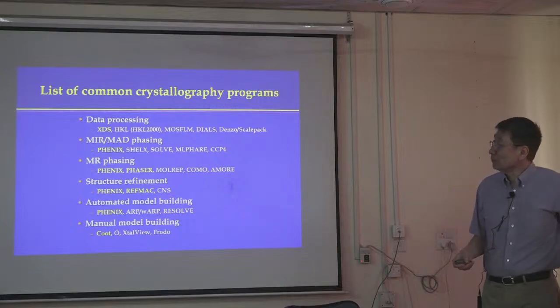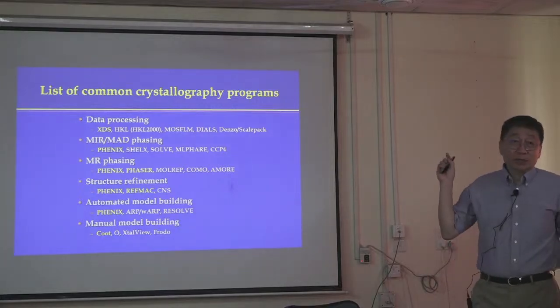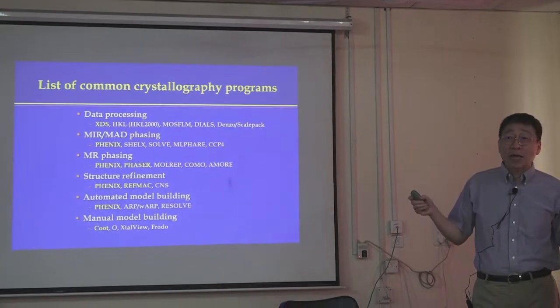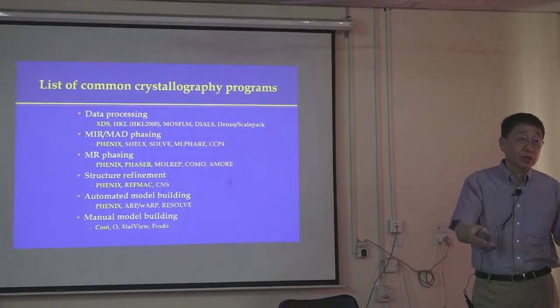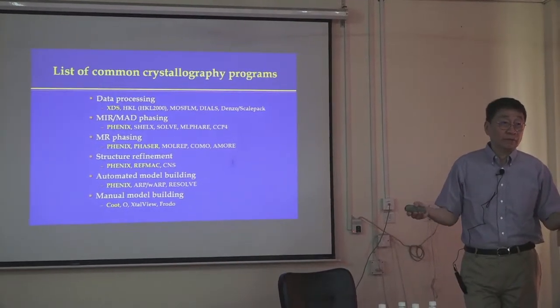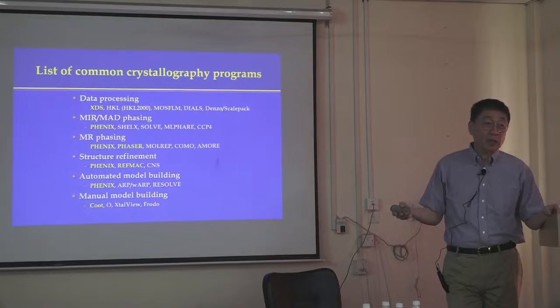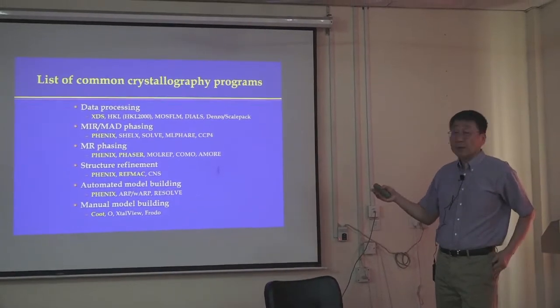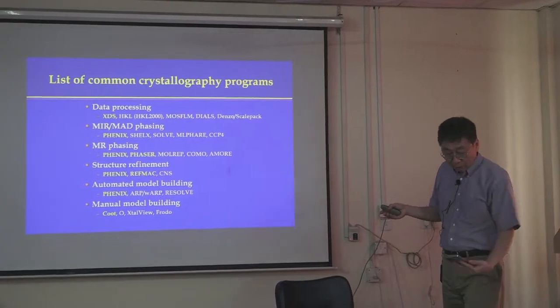take advantage of it. Okay, so the next part for crystallography is mostly application, or as a user of crystal structures or structures in general. What tools are available? Some of this you may be familiar with, like PDB. You're all familiar with, which is good. And then maybe others as well.